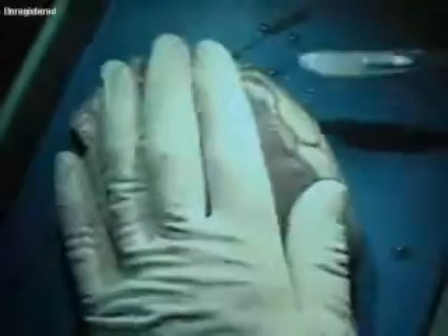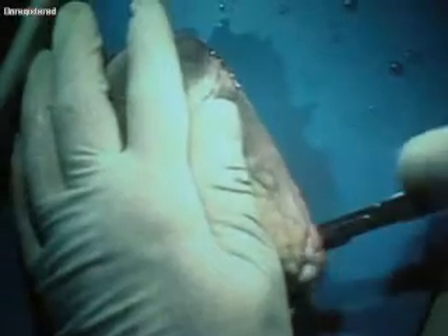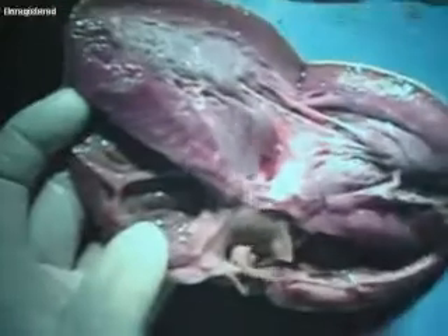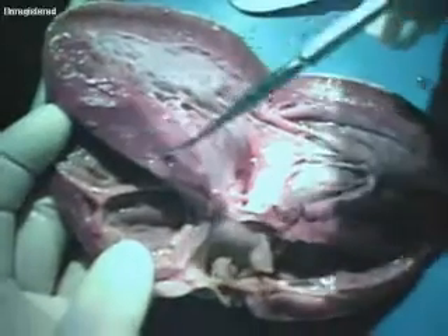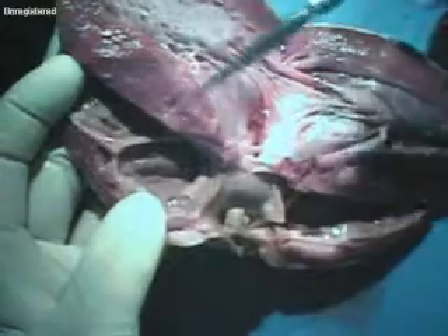So now I'm going to turn it back to the front and go right down the sides. This is very, very sharp, so I'm taking my time because I don't want to become part of the demonstration. Now I'm going to flip it open and you're going to see some interesting things. The first thing I want you to notice is this wall — this is that big wall that separates the right and left ventricle, and it's called the interventricular septum.